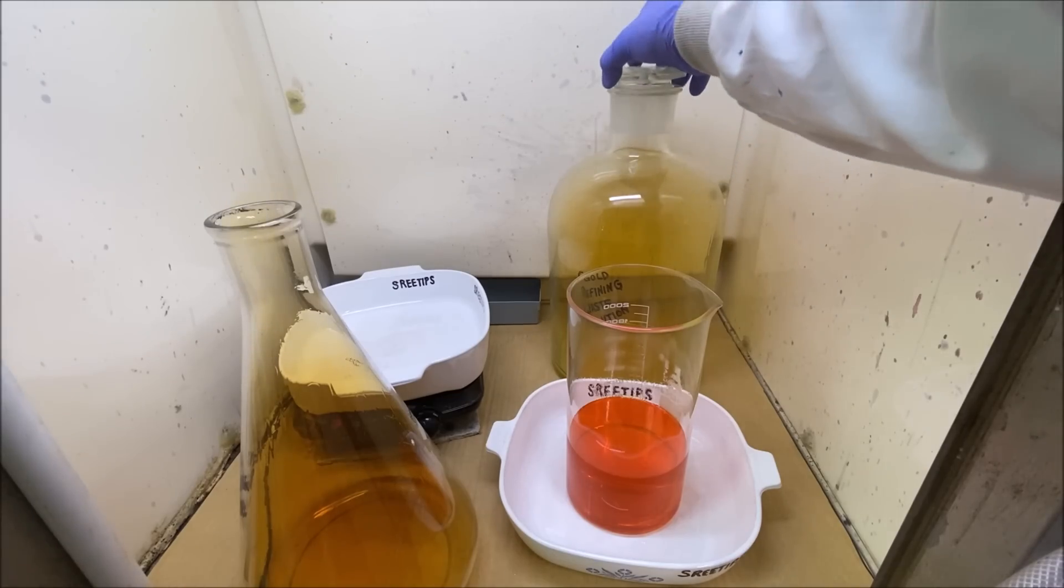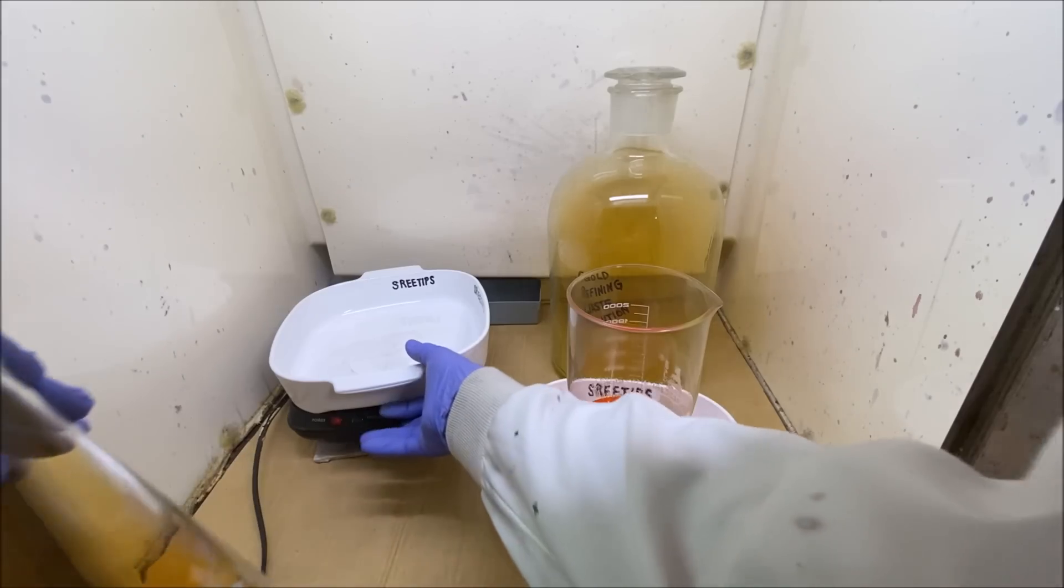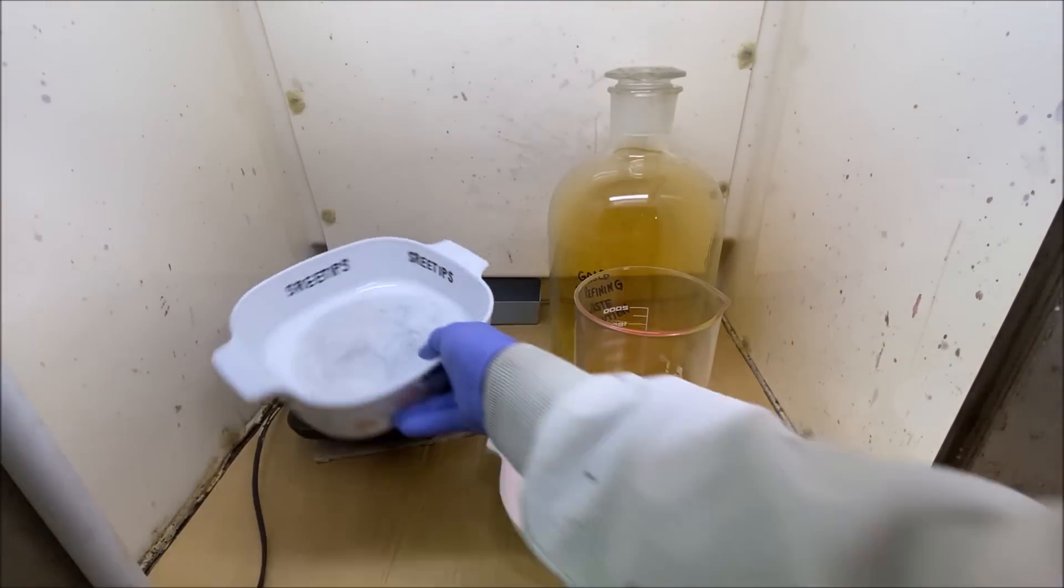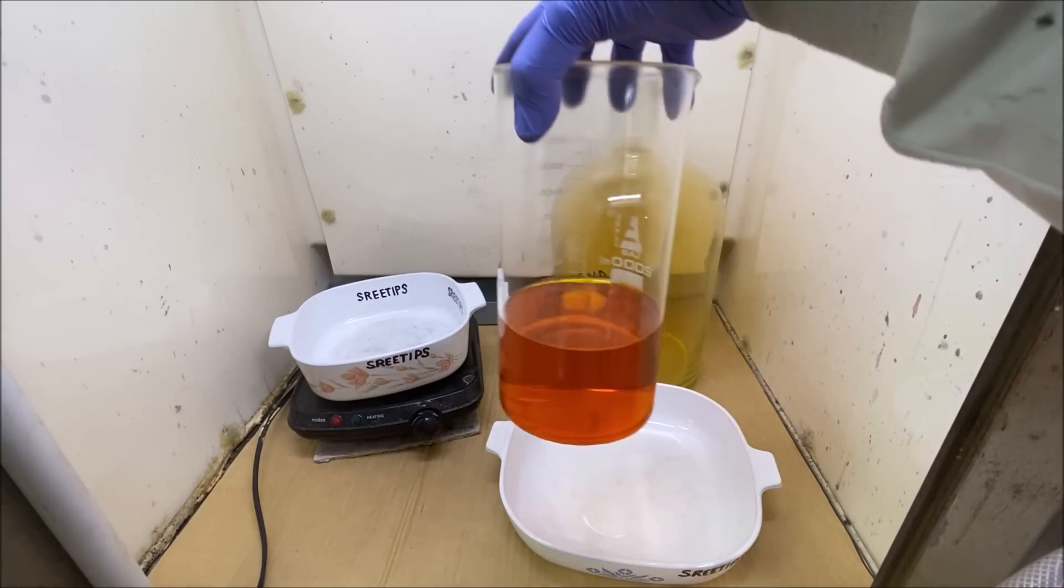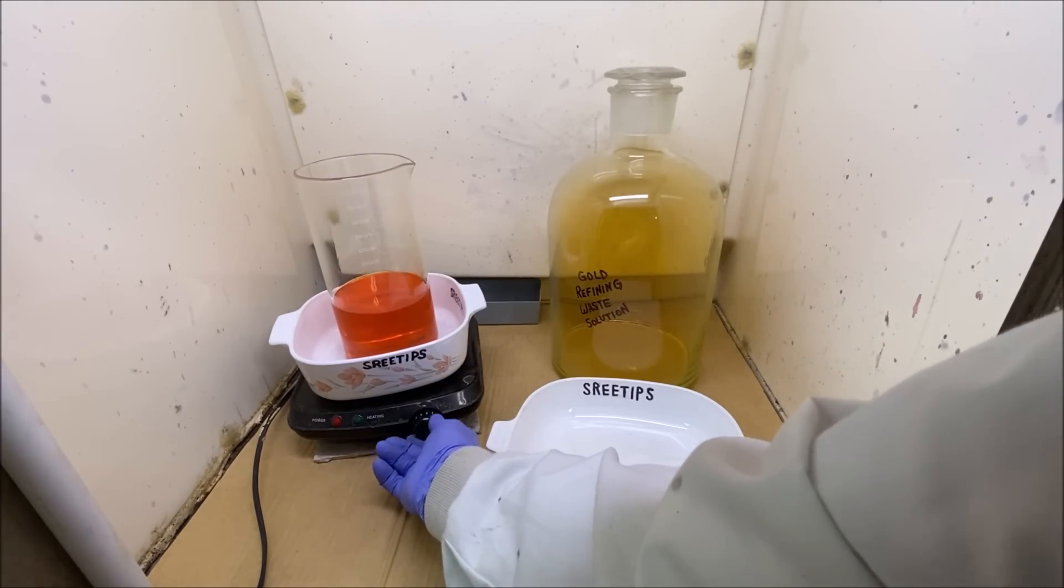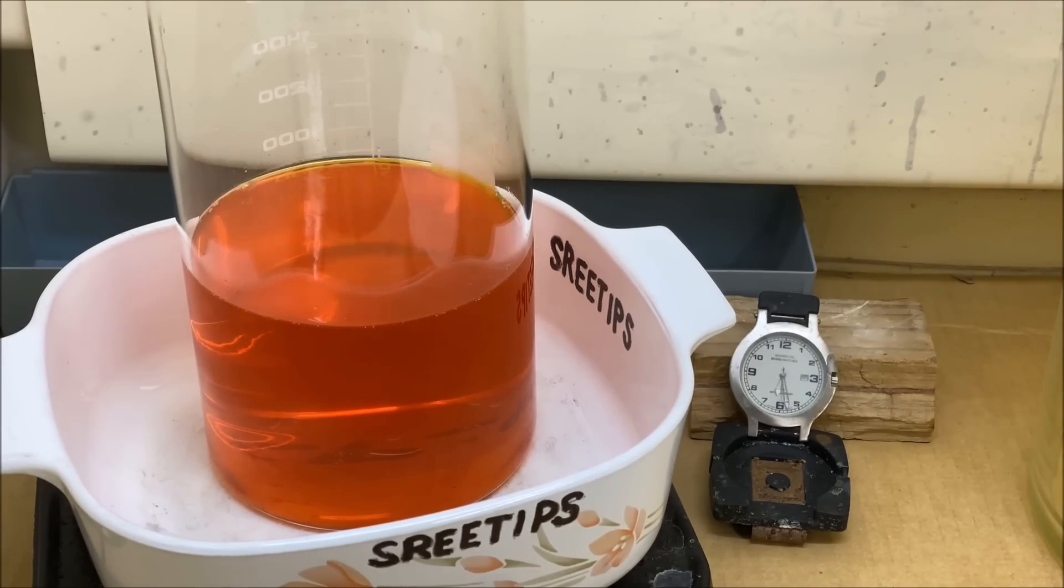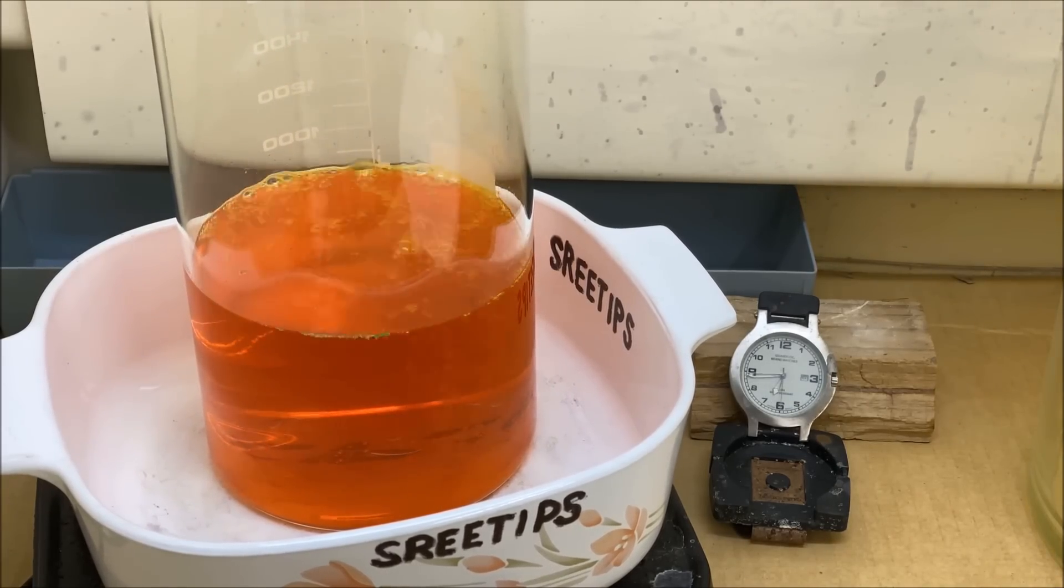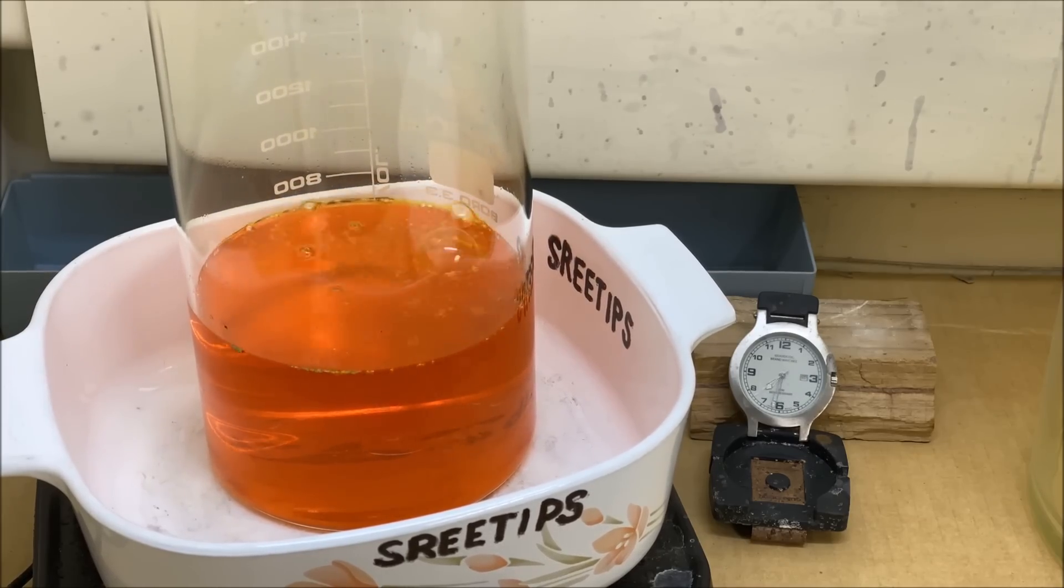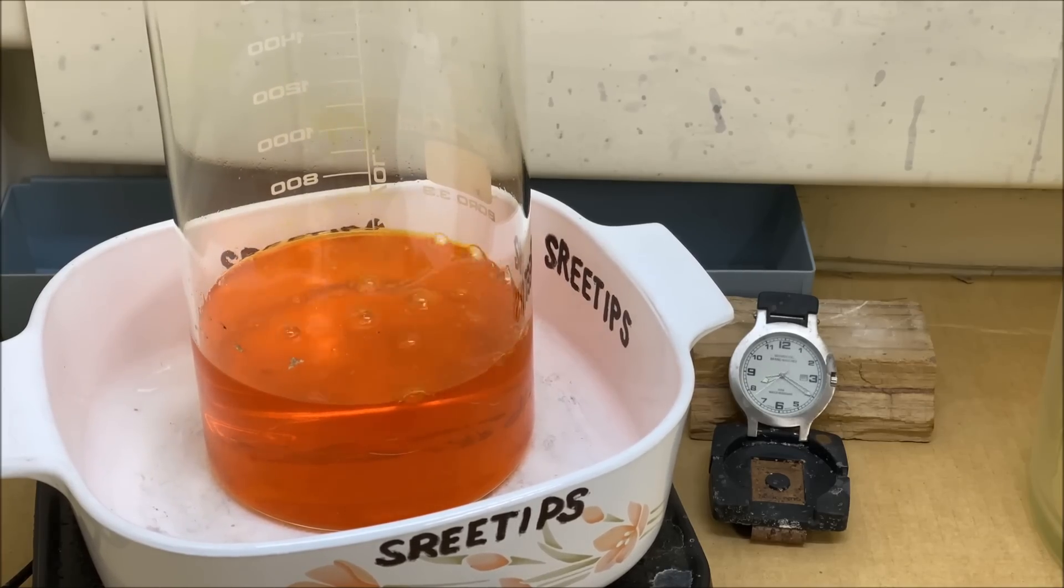Now there's going to be a bunch of extra nitric acid in the gold solution, so what we'll do is we're going to reduce this down, evaporate it down to a syrup to drive off all the extra nitric acid that's in there. In my experience, the best way to rid a gold solution of excess nitric acid is this method right here, evaporating it down to a syrup, and that will drive off any excess nitric that's in there.